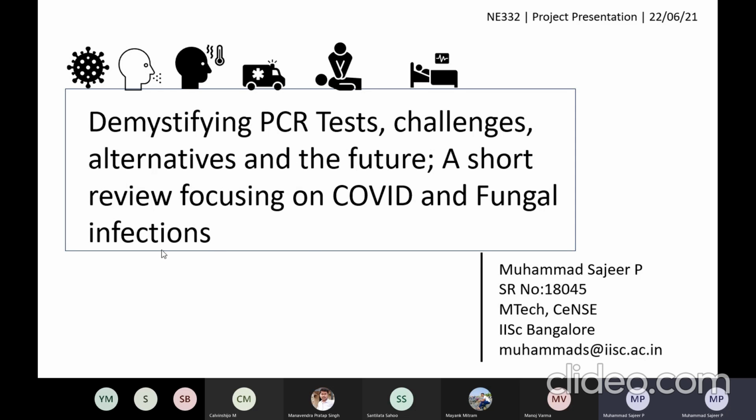So I'll be talking about PCR. Specifically, the topic is demystifying PCR test challenges and alternatives in the future. I'll be reviewing this, focusing on COVID as well as fungal infections.